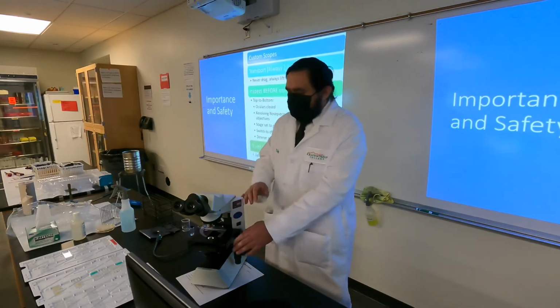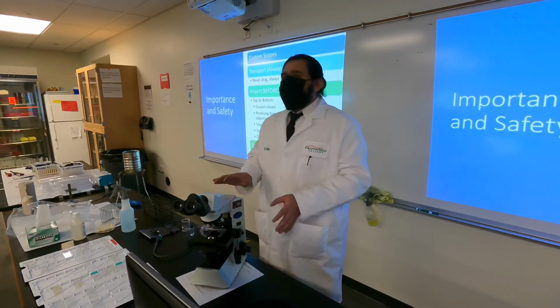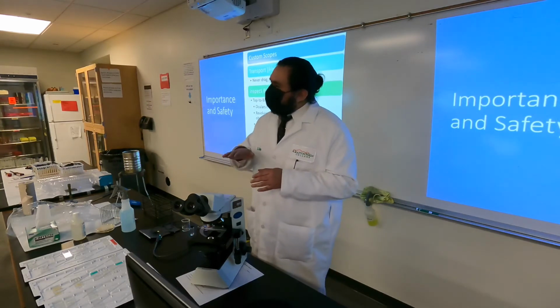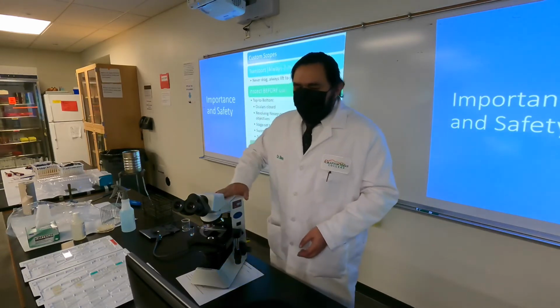Now the stage hitting the back of the arm or the front of the arm itself is a little optional. The only reason I say that is sometimes the scopes get a little old and a little bit loose, and so it might slide a little bit. So it doesn't need to be perfect, but it should be pushed against the arm itself.